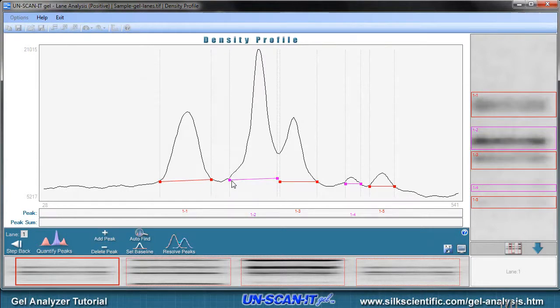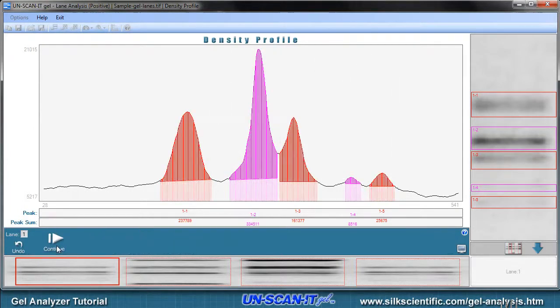After all the peaks and baselines have been assigned, click the quantify peaks button. The software will visually display and store the area above the background that is assigned for each peak in that lane.